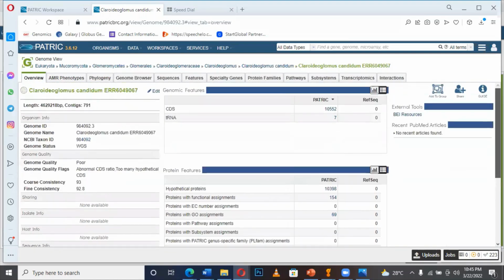All right. We're going to be exploring more of this, how we can do some comparative study between different genomes, and then use the functional genomes like subsystem categories. All right. Certain genes of interest. We're going to be focusing on some of those genes of interest and do comparative analysis.